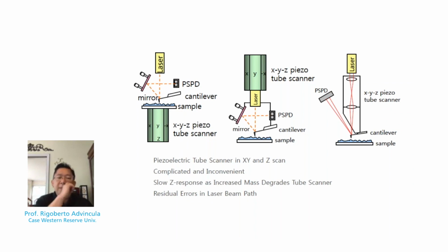Now, let me emphasize here one of the important differentiation of AFM methods is the way the XYZ piezo element is designed. And in most cases, a lot of the techniques out there have various advantages in terms of sensitivity or ability to image various features, in that many types of techniques have claimed to be non-contact and of course contact mode all the way to STM modes.